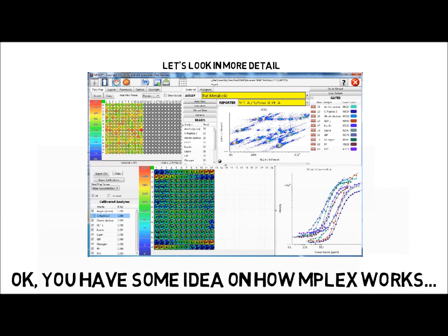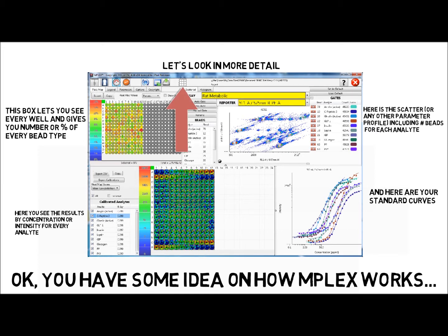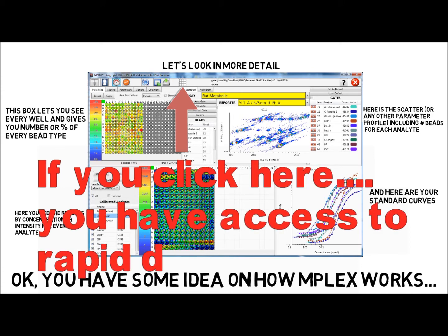Okay, so you have some idea on how MPLEX works. Let's look at more details. This box lets you see every well and gives you the number or percent of every bead. And here you see the results by concentration or intensity for every analyte. Here is the scatter or any other parameter profile including bead number for each analyte. And here are your standard curves. But if you want to click here, you can access rapid data output.